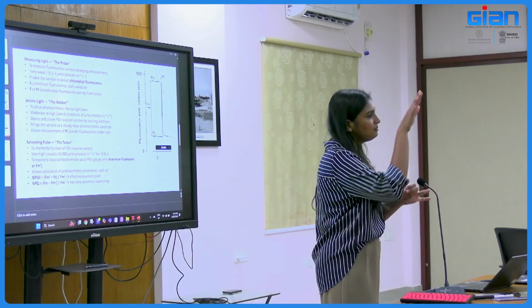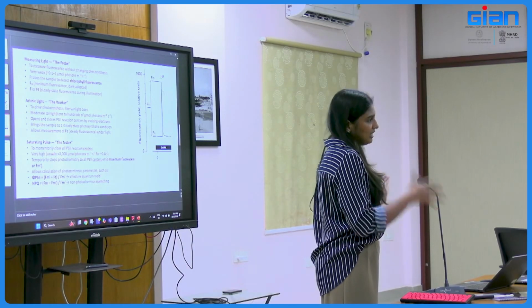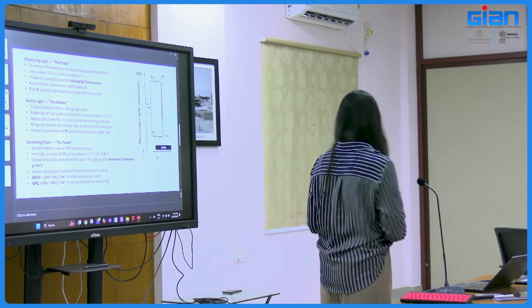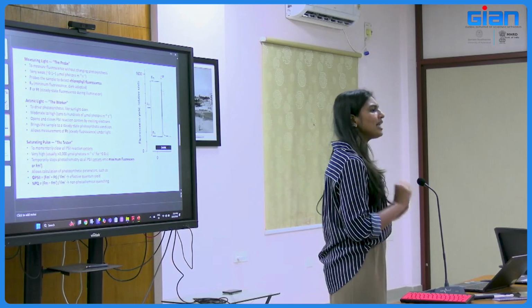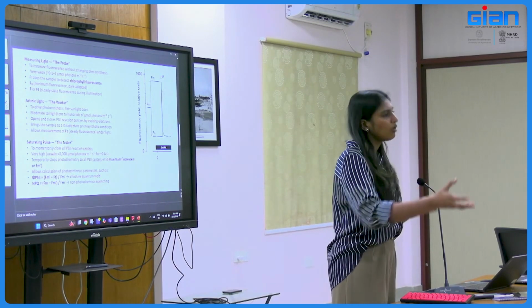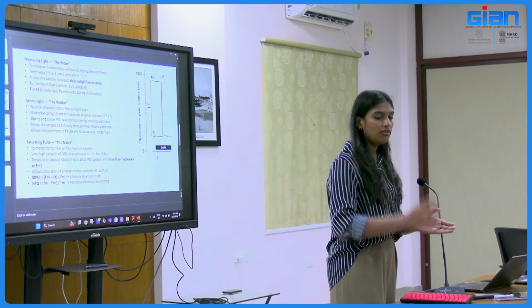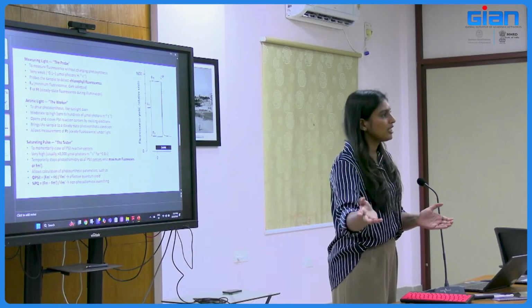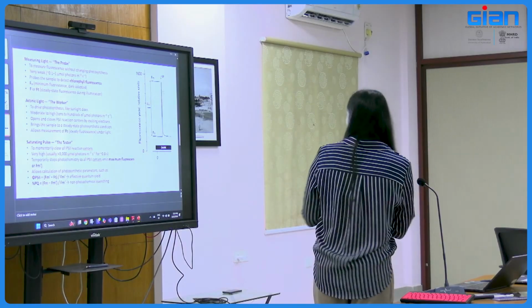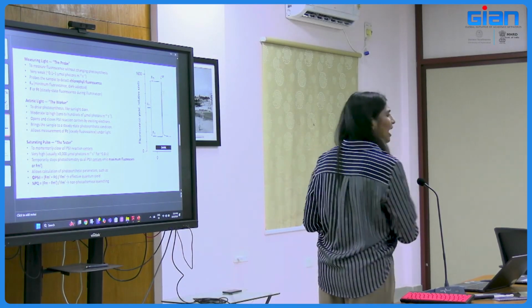This frequent signal can only be detected by the PAM detector part. So we call measuring light the probe, and the second one is actinic light, which is like the worker. I told you measuring light can only give you the chlorophyll fluorescence. It can't make the chlorophyll molecules work for photochemistry or electron transport or anything. It is only a very weak light.